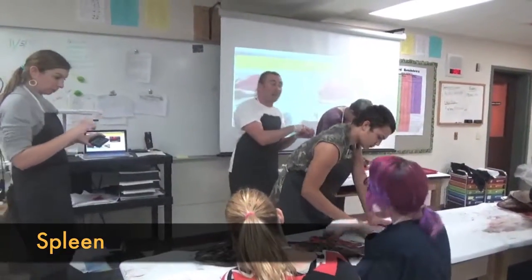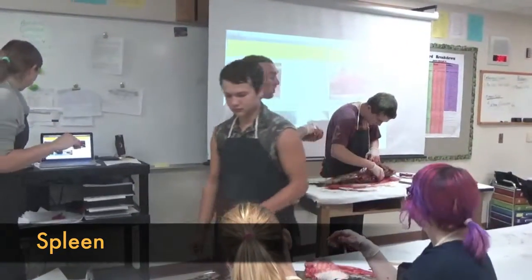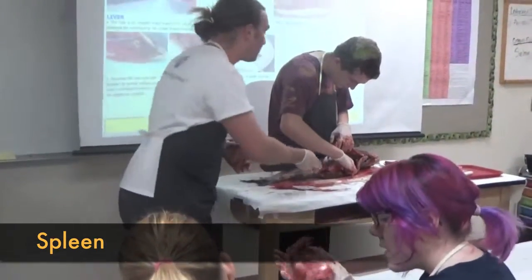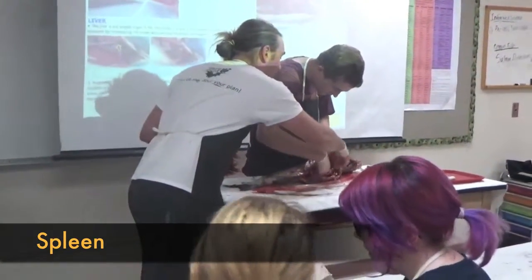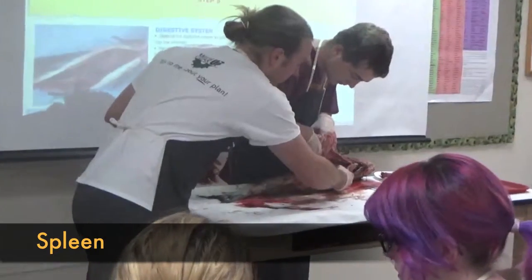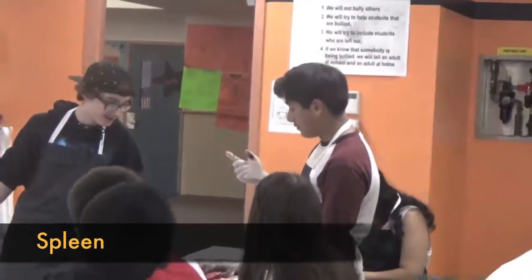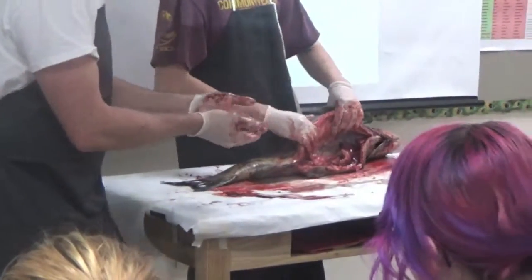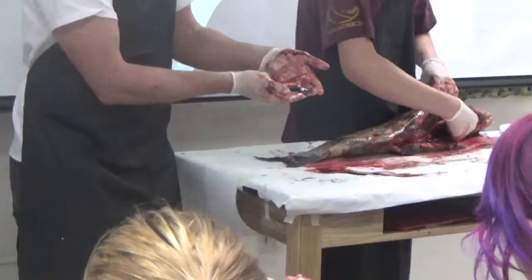You guys probably saw it coming out of the salmon — the bright red, or dark red I should say. The spleen. What does the spleen do? It's a filter for the blood. You can tease it out — a lot of this stuff you can just pull out by hand. That's what our spleen looks like.